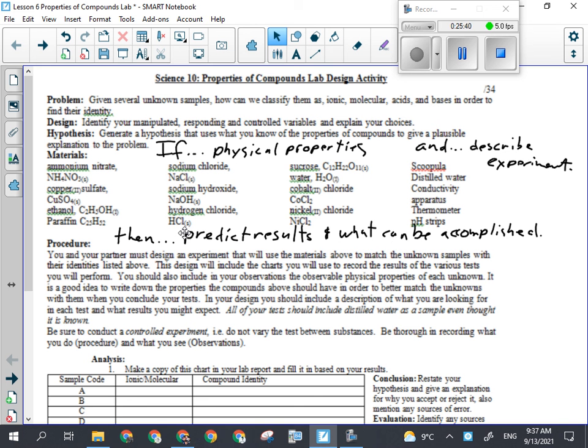Stir it. Now, you'll notice that these two devices are somewhat different. One is a thermometer, and the other is a stirring rod. Please do not use the thermometer as a stirring rod. It has a different job. I only say that because I see people start stirring with the thermometer and then they snap the thermometer. We don't want that.